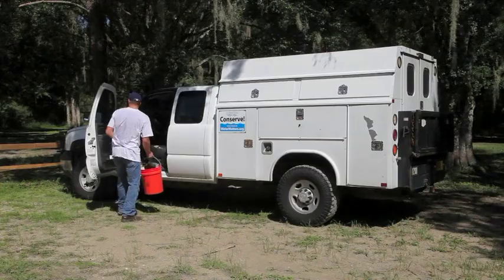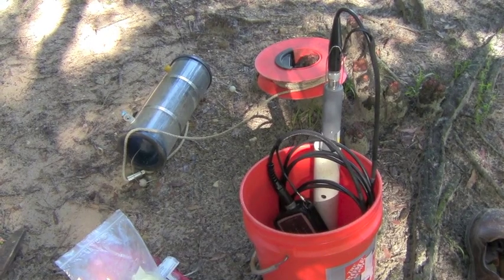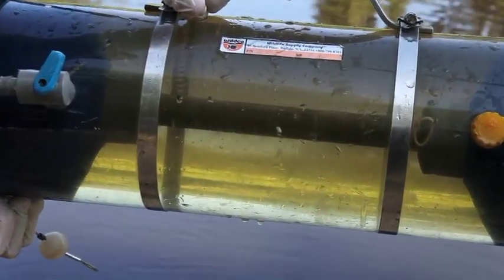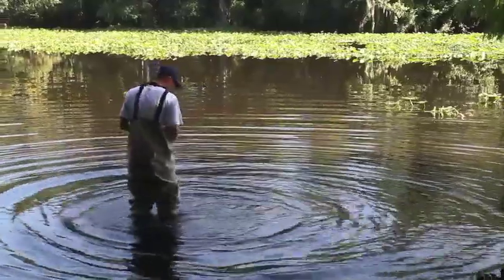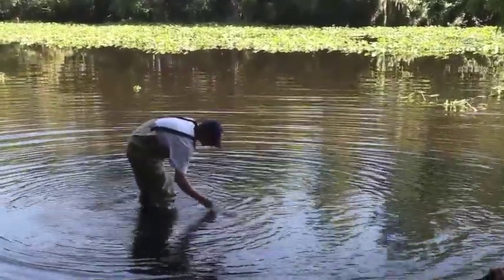Scientists, such as this one from the Southwest Florida Water Management District, use many methods and instruments to test parameters that help determine water quality. Some parameters are tested at a laboratory, while others can be tested at the water source. Let's talk about a few of those.